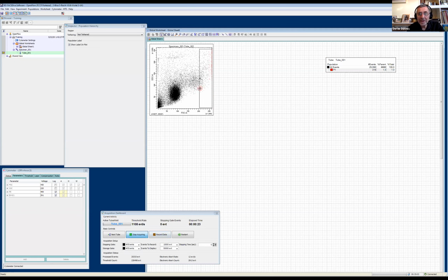Can I just say something, Kathy? This is something that sometimes fools people, I think, when they first come to the cytometer, because as you saw, we saw events on the screen, but they were certainly not our cells. That was the debris that we were amplifying too much. And all the events were jammed up against the axis. Sometimes if you're inexperienced, you wouldn't see that. So the more you understand about your cells, the easier this will become. And it all comes with experience.